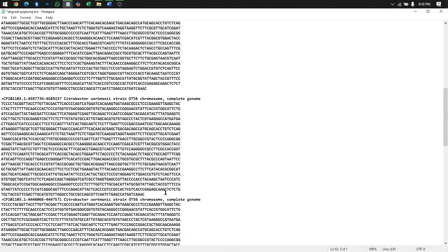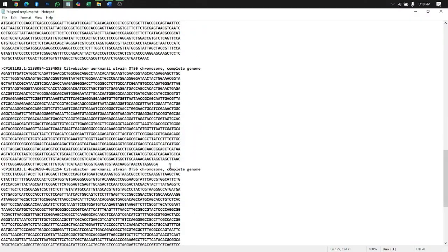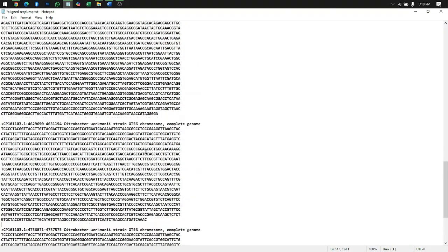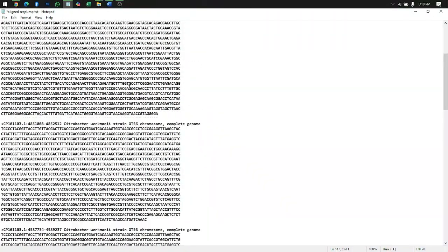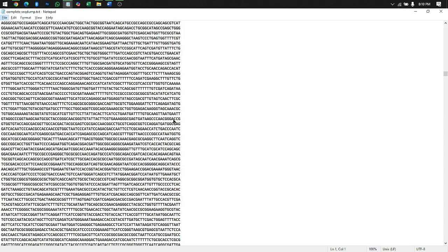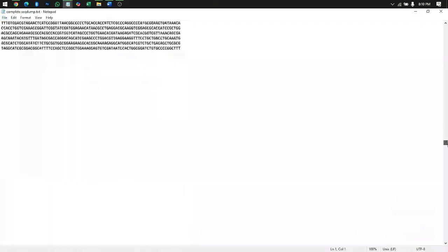It still contains almost all the DNA sequence, not exactly all, but it has segments. These segments are responsible for particular traits or genes. This is the difference between the aligned and the complete. The complete will give you everything without breaking it down.